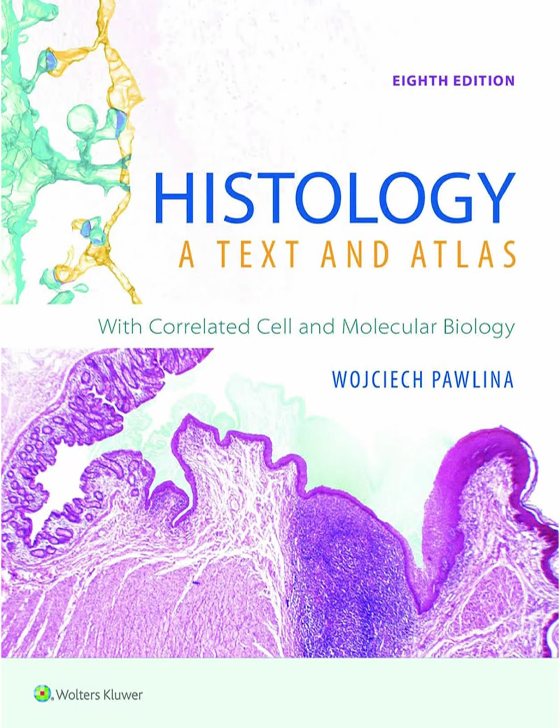And beyond H&E, there are loads of selective stains. For instance, orcein or resorcin-fuchsin highlight elastic fibers. Silver impregnation methods are great for reticular fibers and basement membranes. Tiny structures H&E often just glosses over. So we've gone from preserving tissue to basic staining to specialized stains for specific molecules like fats or fibers.